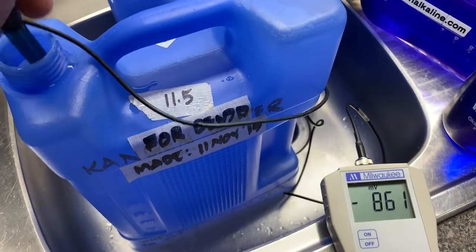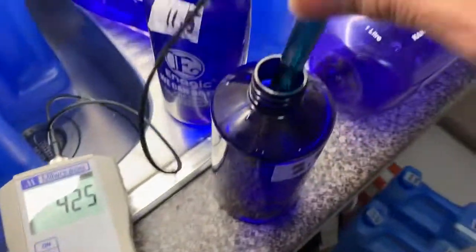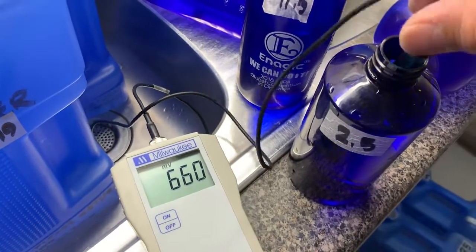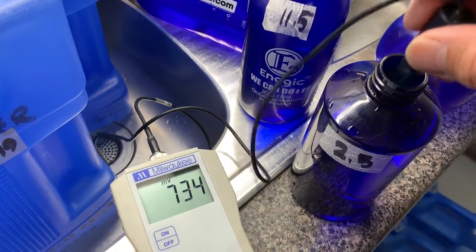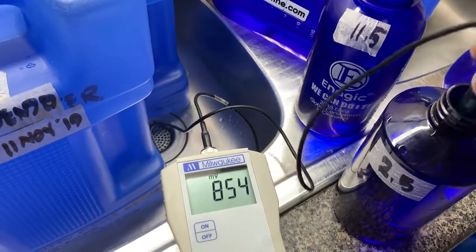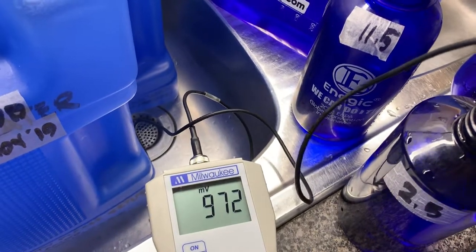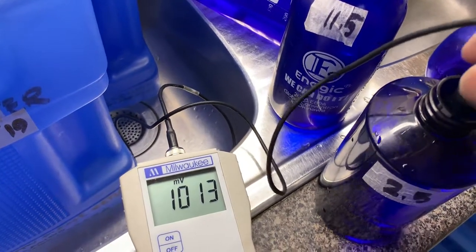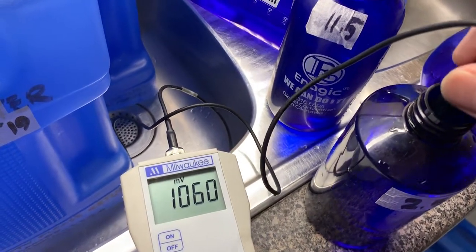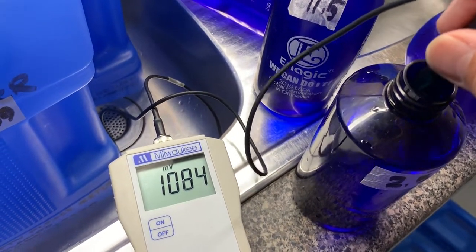Negative 860 plus — okay. Now jump again to 2.5. That's on the positive now. So make sure you switch them — negative, switch them to 11.5 and 2.5 — three times at least, four times, five times is better. Okay, I'm going to show you again — once it switches to 1100, we'll switch to 11.5.